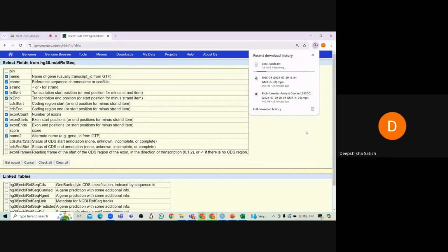Okay. So was the FASTA sequence retrieved properly? Yeah, because I had selected the show region, and I just entered the numbers after calculating from the feature section which one is the UTR region. Okay, all right.